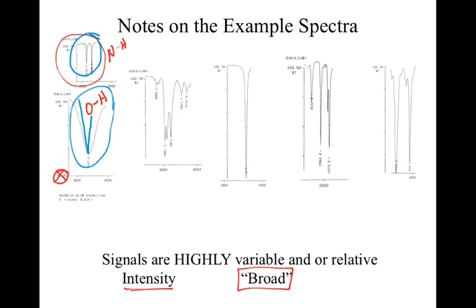Okay? Same idea kind of applies in all of our other sections. I did kind of outline these. We're looking at our CHs, the CO, our C=C double bonds, and then sometimes the carbon-oxygen single bond. Okay? Hopefully that kind of clarifies the idea when you look at these.